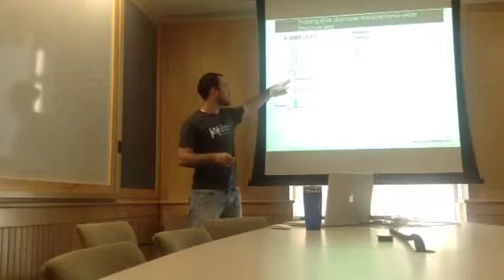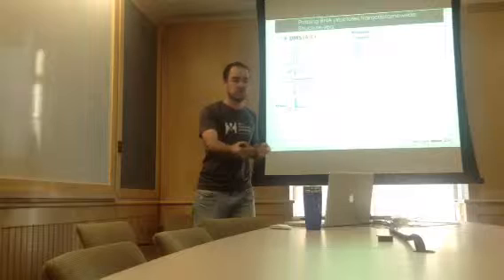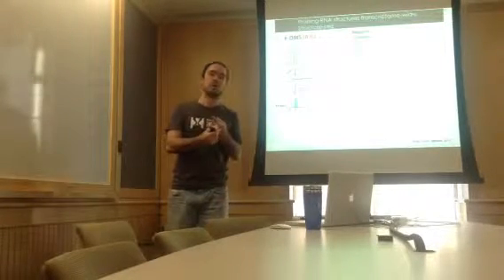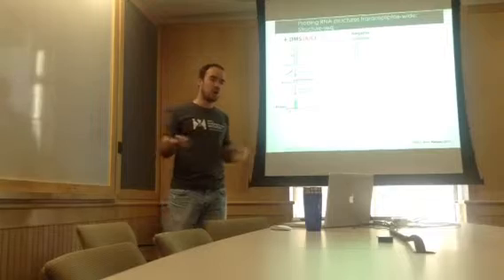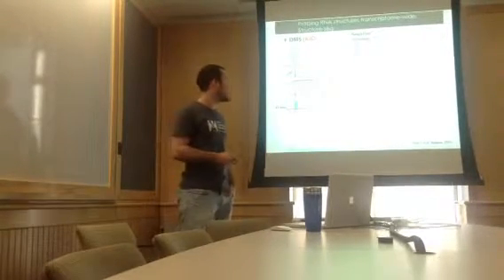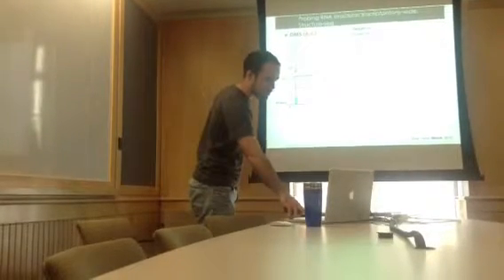First, it reaches a modification site, or it reaches the end of the transcript, which makes sense, or it reaches an RT drop-off prone region that can be a highly stable structure or a repetitive element. And they are actually quite frequent, so it is why it's really important to have a negative control in this case.